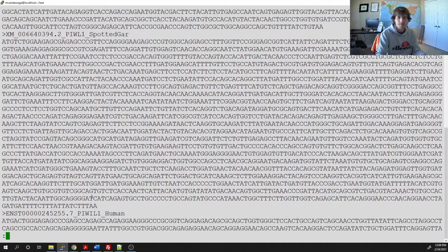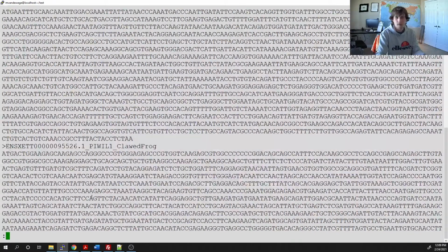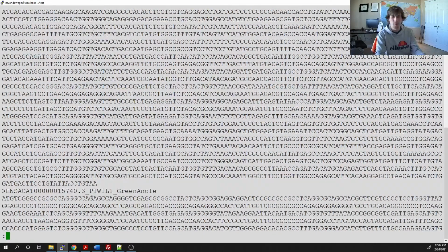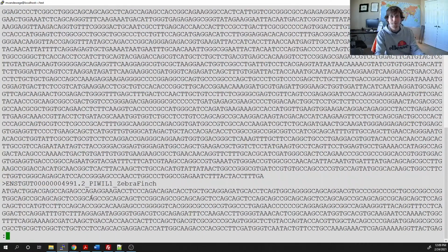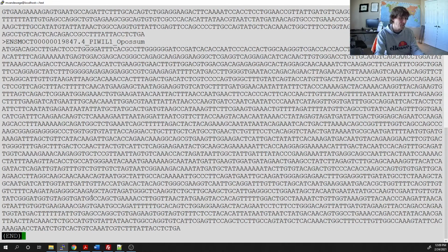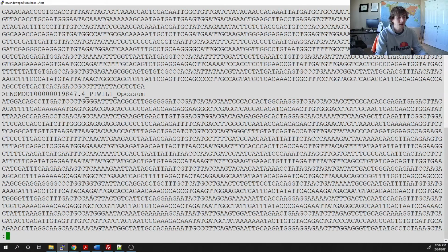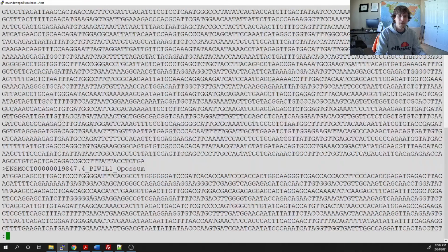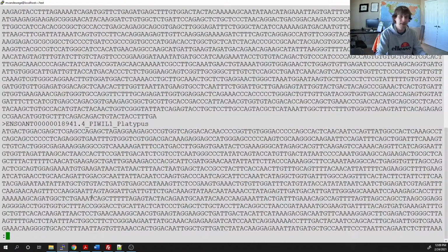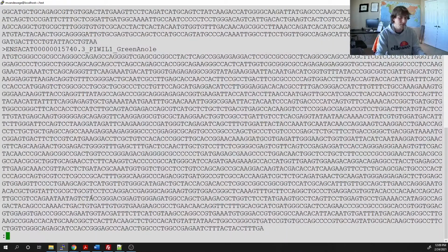at will. So I can see all of my headers, all of my sequences, etc., with this less command. And so less is just another way to look at file contents. Again, I don't want to write out a new file and then go look at it. I would rather have a file already made and then be able to look through it with these three commands.